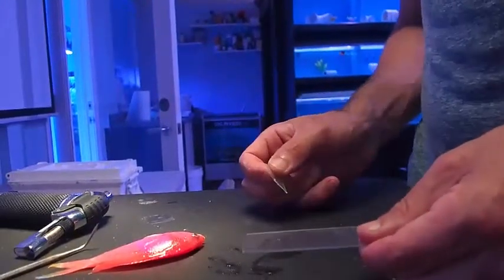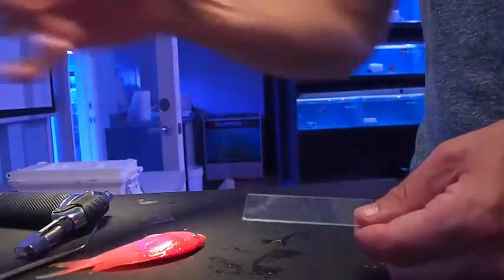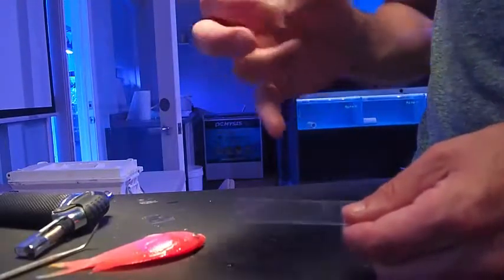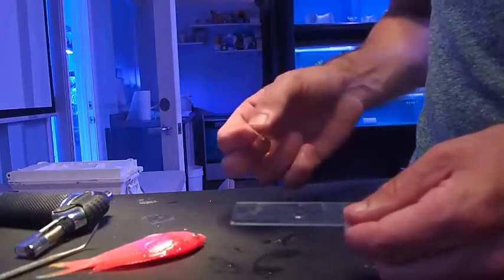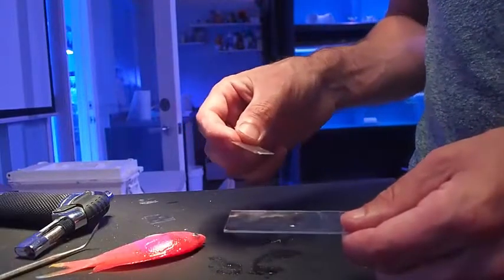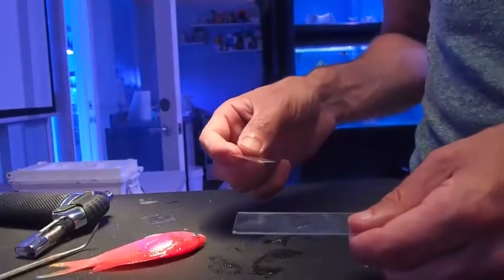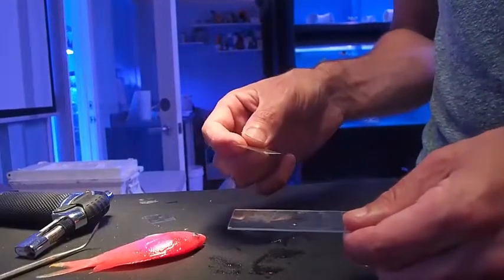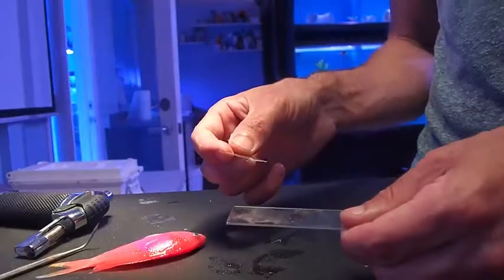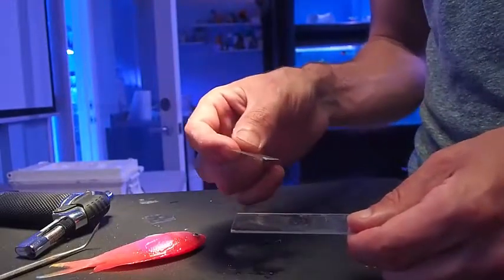Just to demonstrate how to put the skin scrape sample onto a slide — you actually want to get a little puddle of water from the tank that the fish was in and put one drop, either with your finger or a dropper, onto the slide. Alternatively, you can use saline water to be sterile and ensure it's clean, but you don't want to put a fresh water drop on the slide with salt water animals on there because they will very quickly become compromised osmotically.